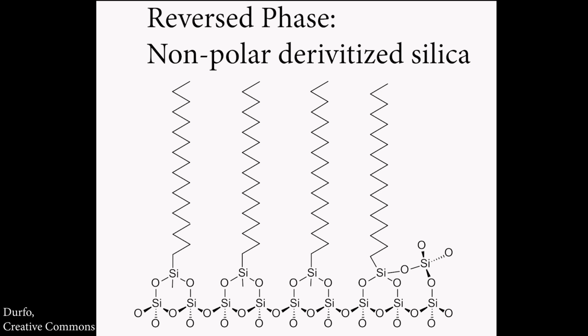Almost all organic molecules have some affinity for a C18 column. They'll stick at least a little bit, and we don't want them coming out at t_M. So we want everybody to stick at least a little bit. Now you'll notice over to the side here, there's this SiO group on the right that doesn't have any C18s attached to it. That's called end capping.